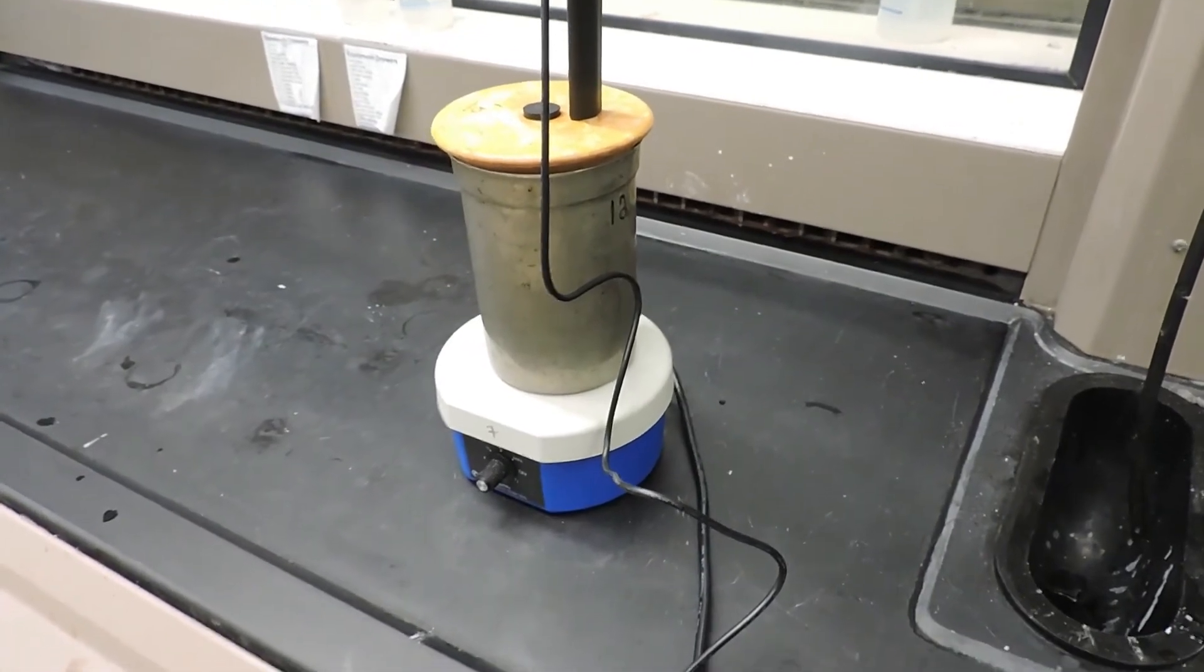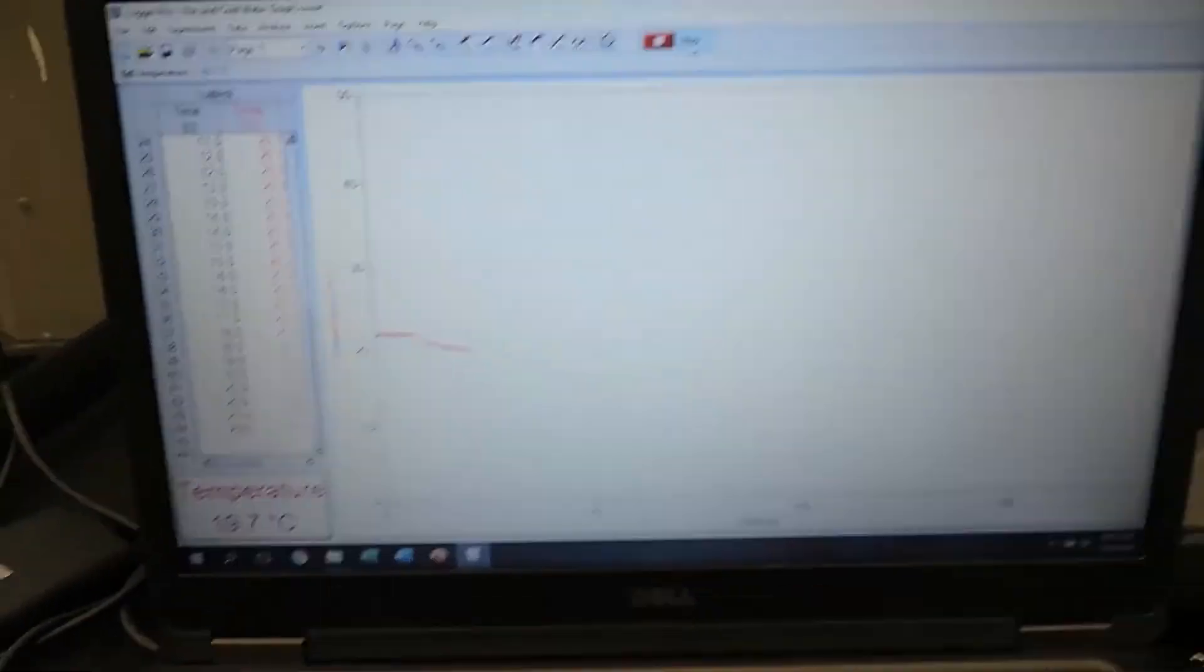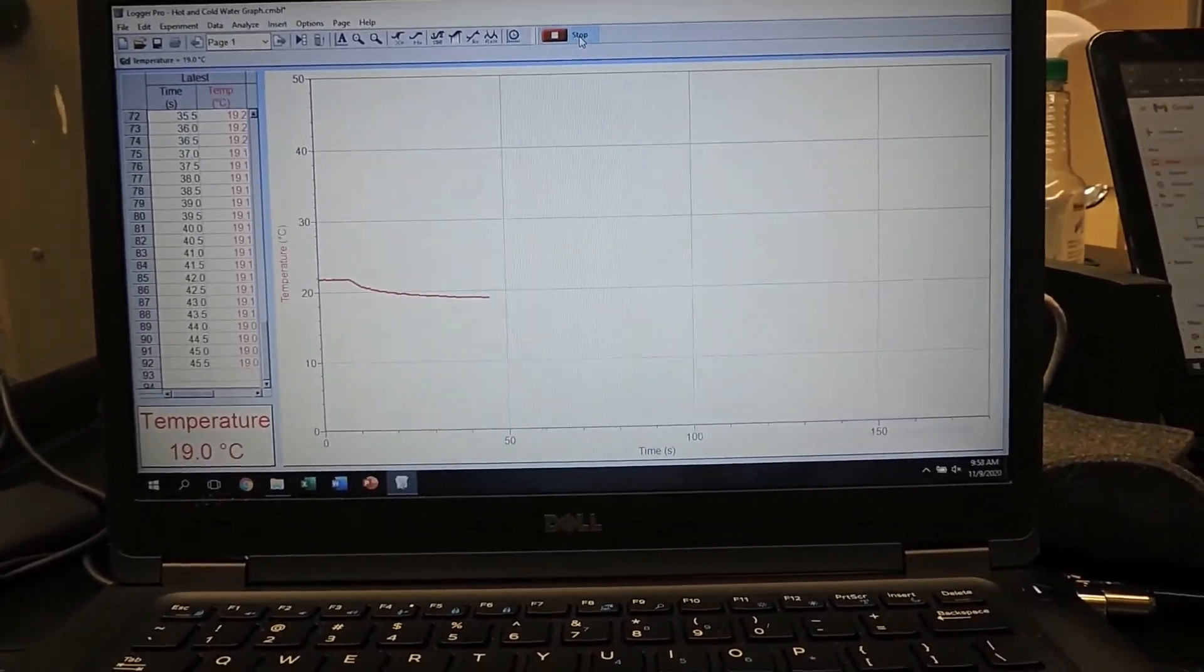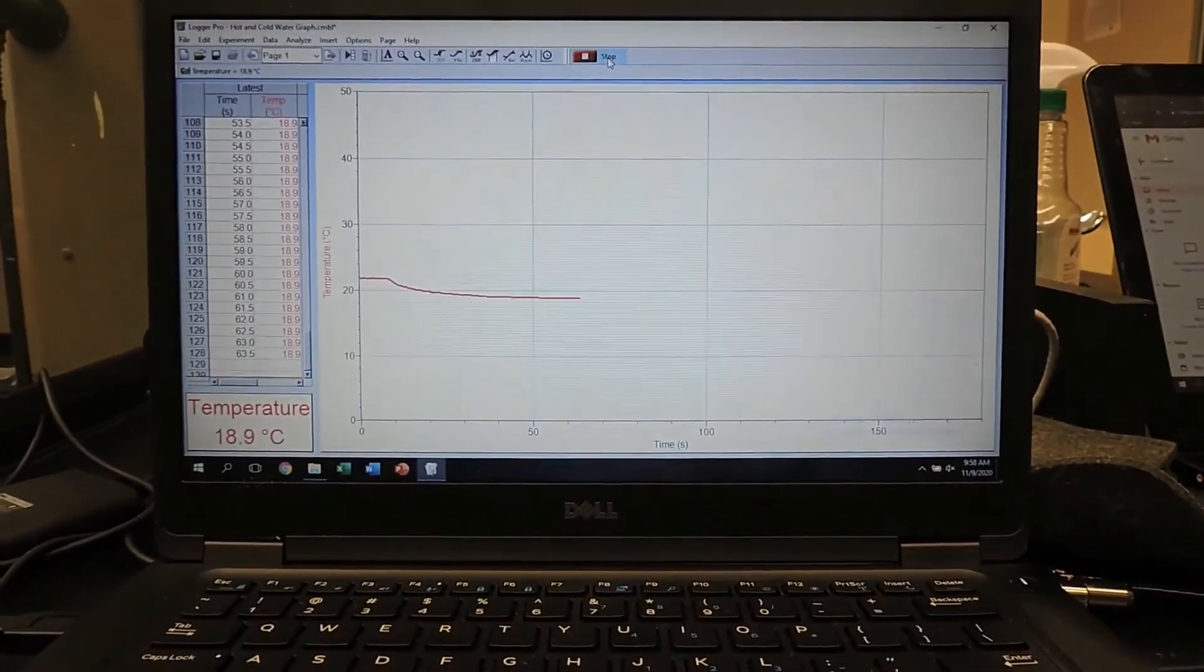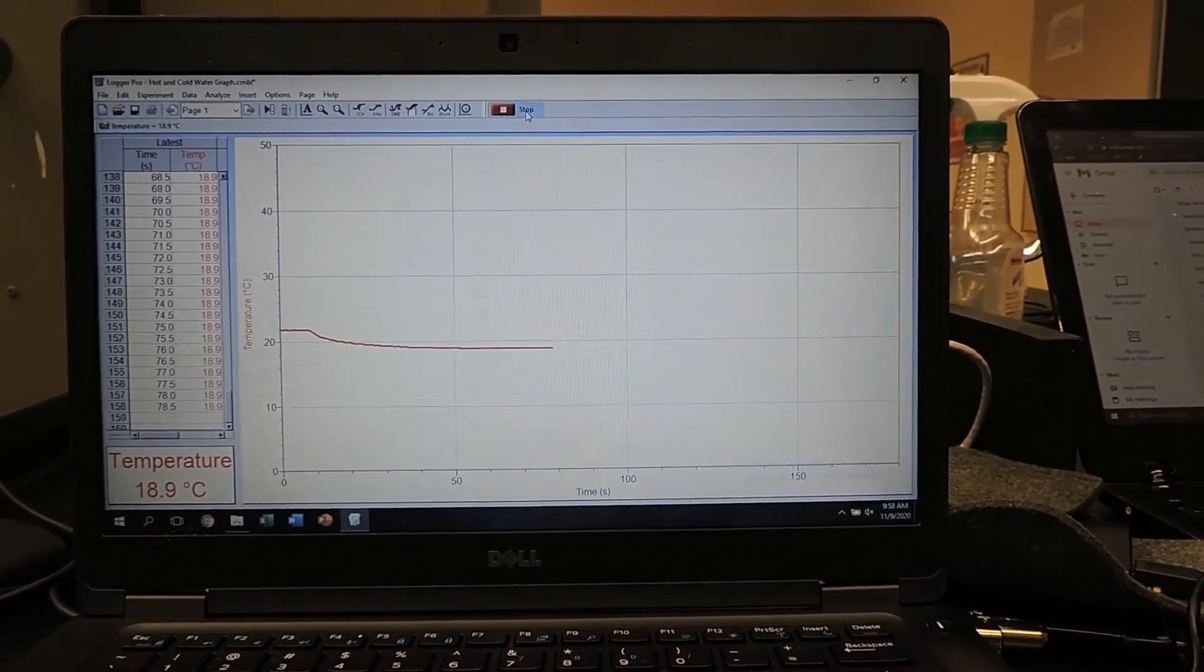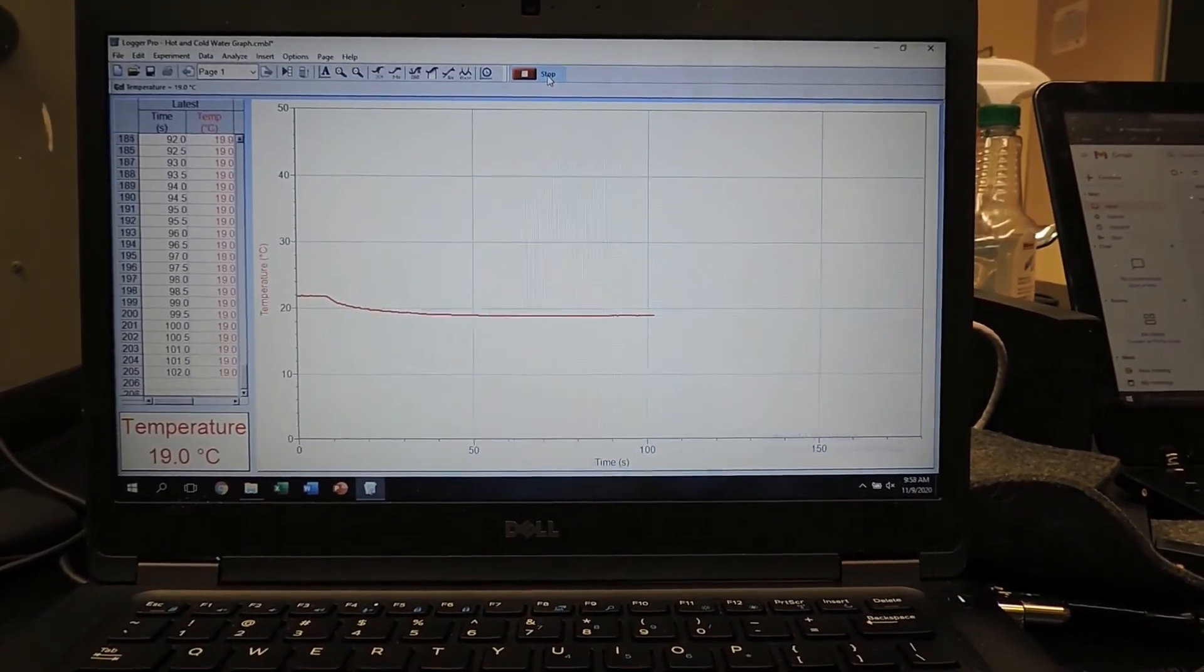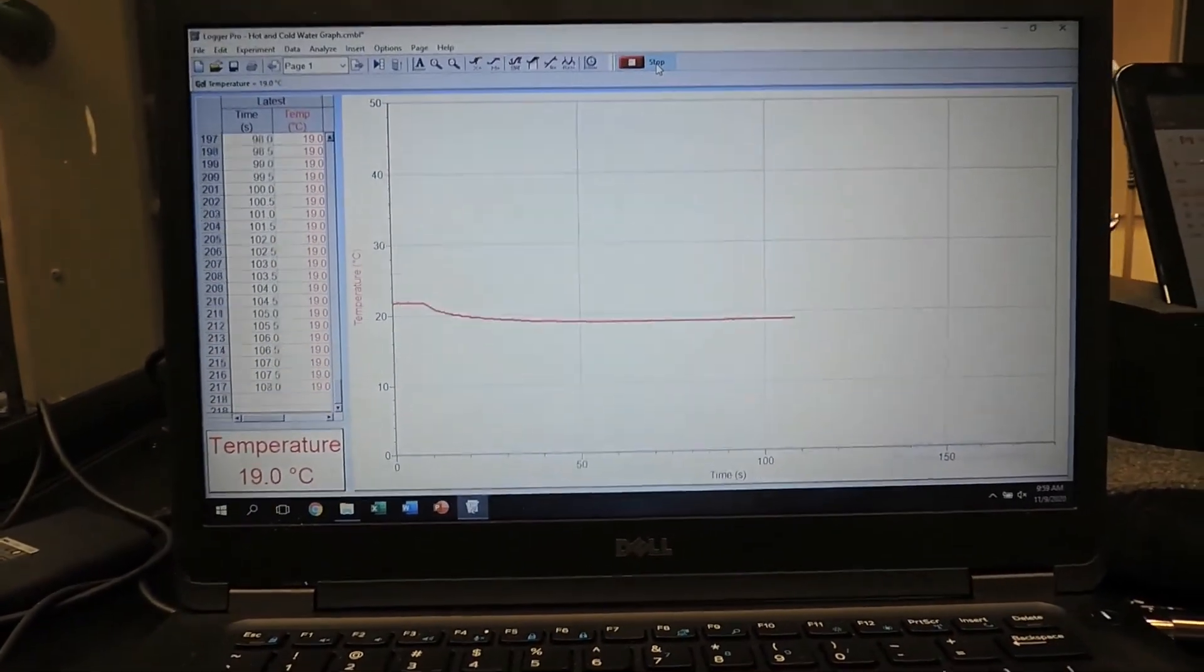Now that we've added potassium iodide, we'll let it stir and monitor the graph. It appears that the temperature has stabilized, and we are at 19 degrees Celsius as our final temperature.